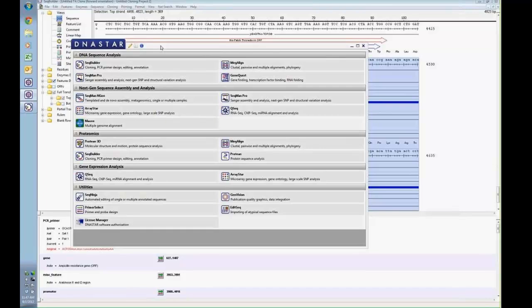What's very important, whatever enzymes that you select, is one, you want to make sure that it's in frame with whatever promoter you're using for expression, and then two, I would really make sure that you look at the codon usage charts to make sure that that's optimized for whatever expression strategy you're utilizing. But yeah, you have the ability to select whatever enzymes you want to display as well as use for whatever cloning strategies you want.